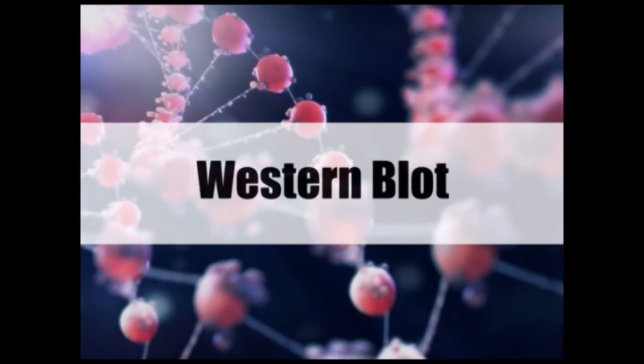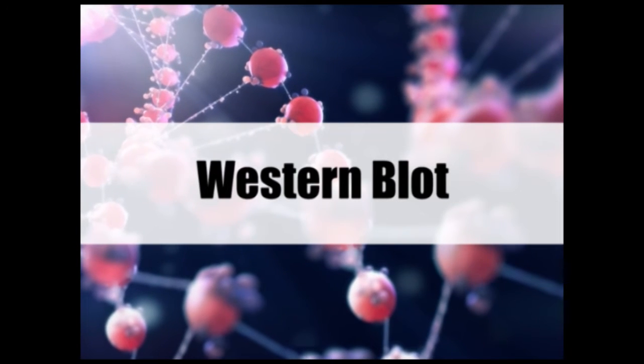Western blot is carried out on a membrane, whereas ELISA is performed in a microtiter plate. Both techniques employ the specificity of interaction between antigen and antibody. We'll first discuss Western blot.